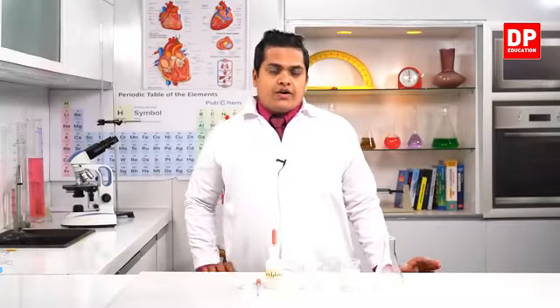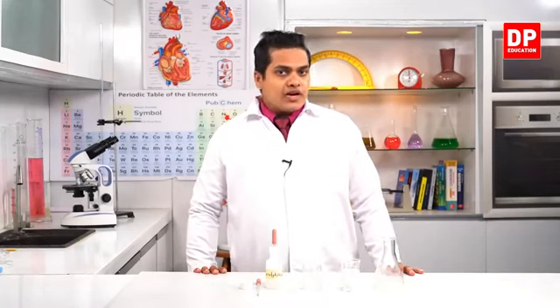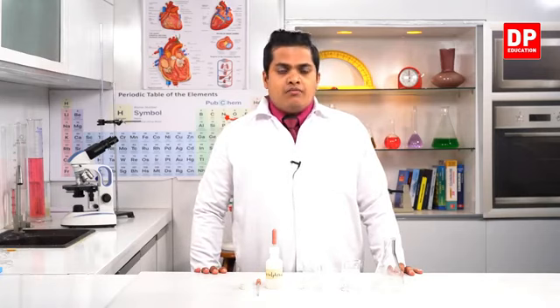Right, my dear children. Now in this experiment, we'll be observing what kind of a reaction this neutralization reaction is. In a neutralization reaction, an acid is reacted with a base, or a base is reacting with an acid. When reacting an acid with a base or a base with an acid, both the acidic and basic features disappear to form neutral substances.